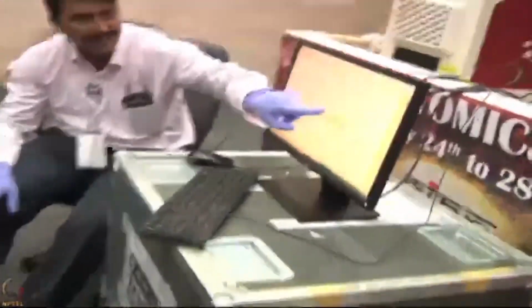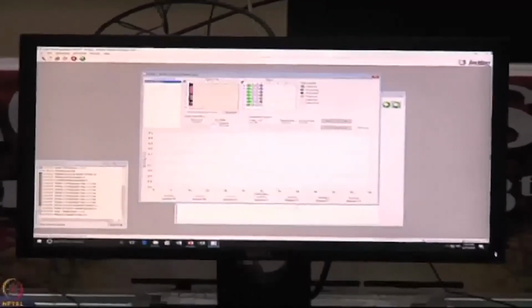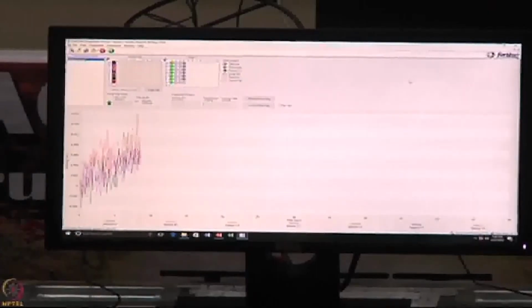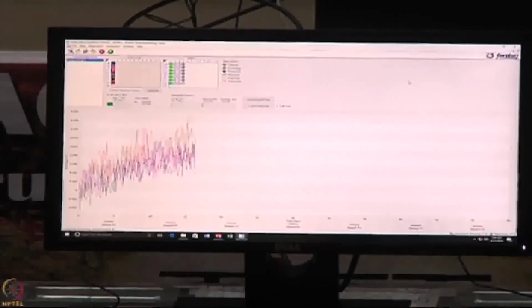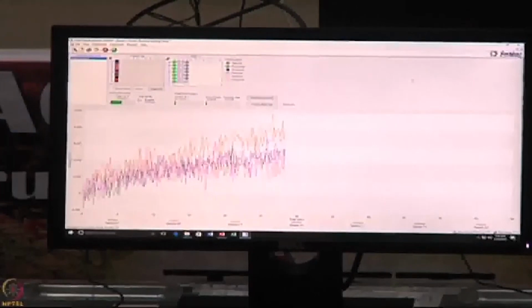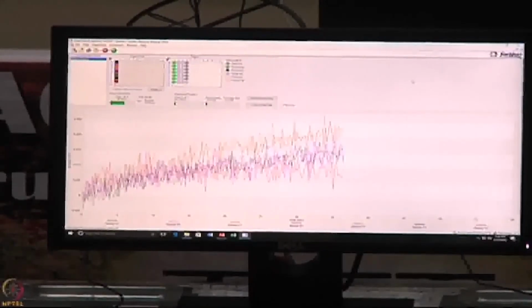There is one warning message. So these are the statuses. There are some incubation times and all. So now if you look at it, it's dipping in the first well containing a buffer. Nothing is there. It's kind of very noisy data. 60 seconds will acquire the baseline. As I mentioned, we have software where we can extend the time as well as jump to the next step, one good advantage. So nothing is binding. That's why there are no interference changes from the sensor tip.